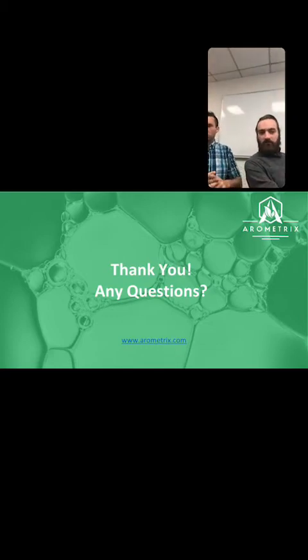Also, we only scratched the surface with some of the HPLC standards here. This is because we are still going through some of the other HPLC standards. Also, these things degrade really quickly, and that's something we didn't know initially. So early May. Sorry. We will be posting this presentation so you can see that spectrum. We will be making a campaign that our marketing managers have already started, so it's pretty awesome that you'll see that on our Instagram.